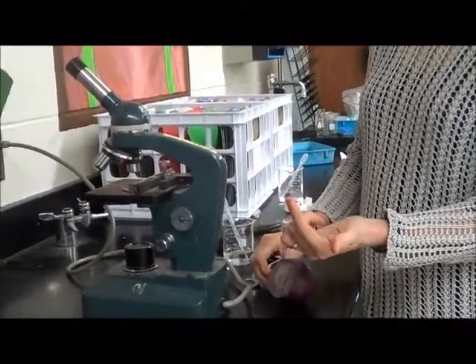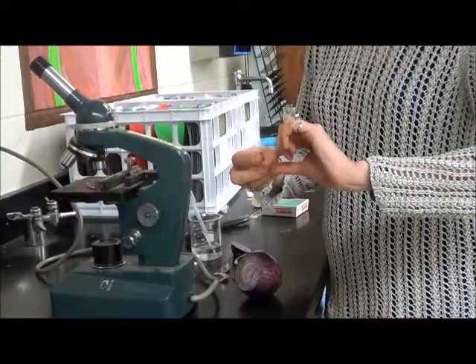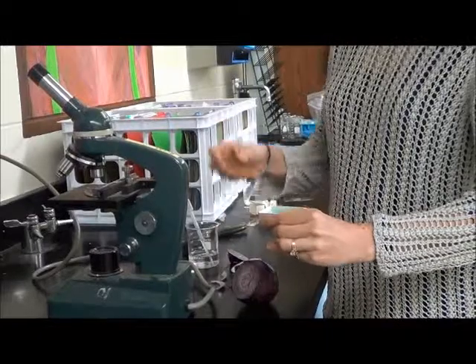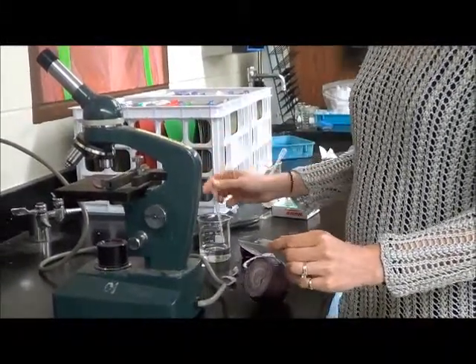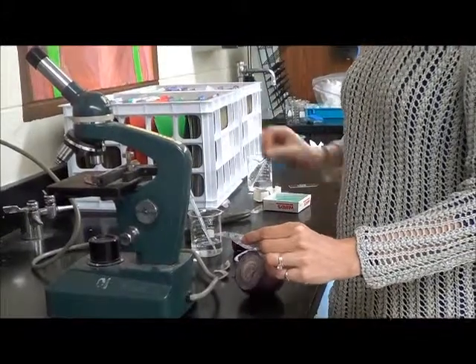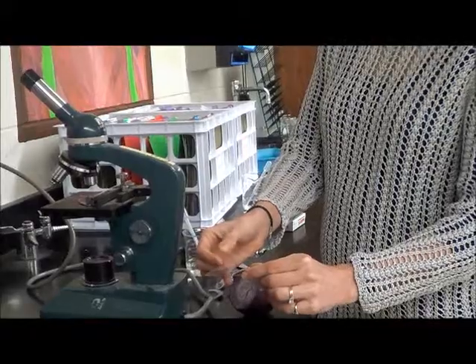And so I peeled it back, and we have this little thin section, and that's going to go right on the microscope slide. And then I'm going to put a drop of distilled water on it, and a cover slip. So with the cover slip, you put it on sideways like this, and then you're less likely to get bubbles.